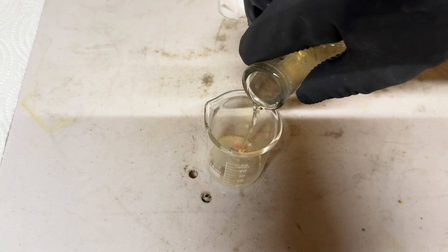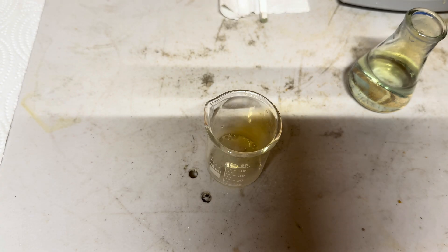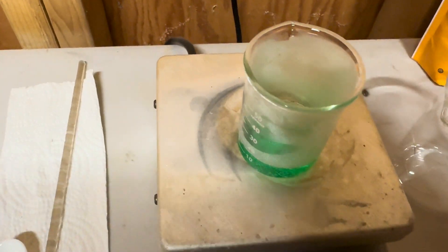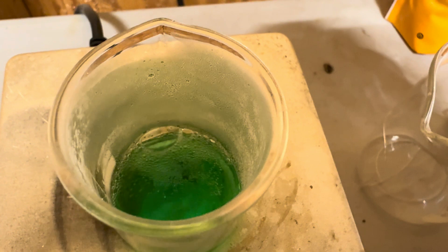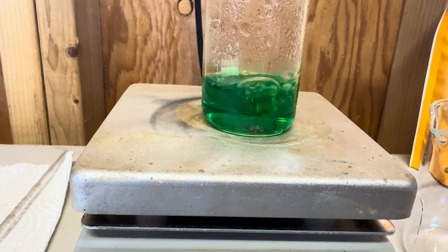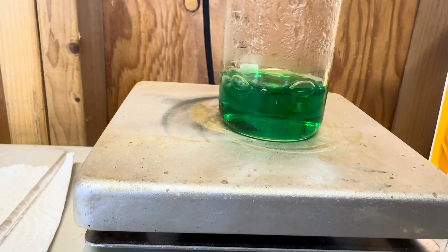Only nitric acid can dissolve copper, and here we demonstrate that.